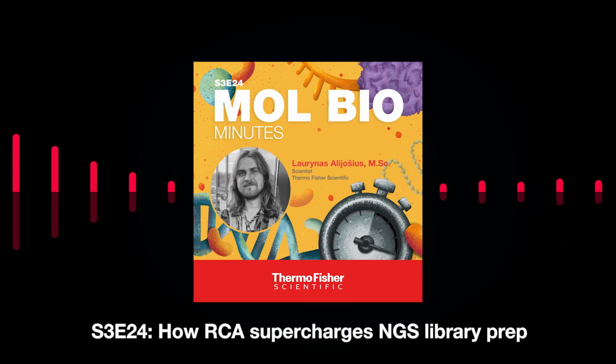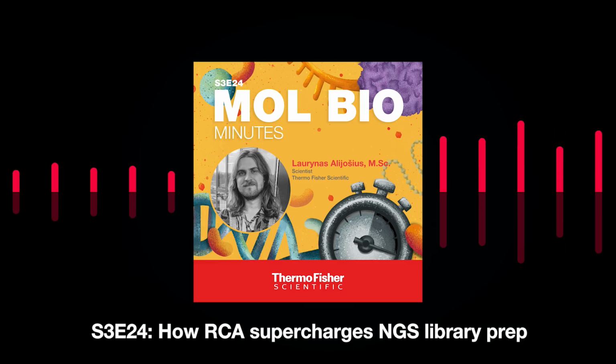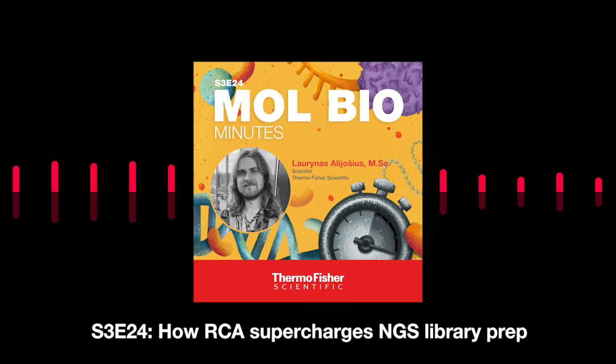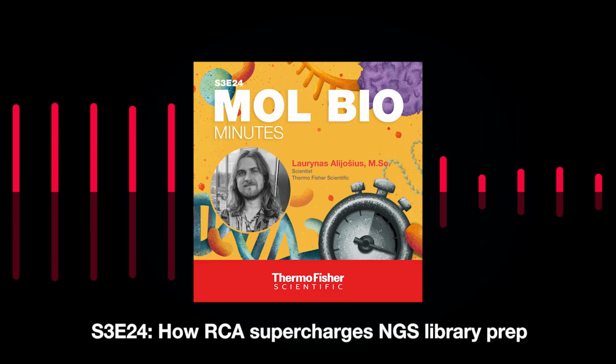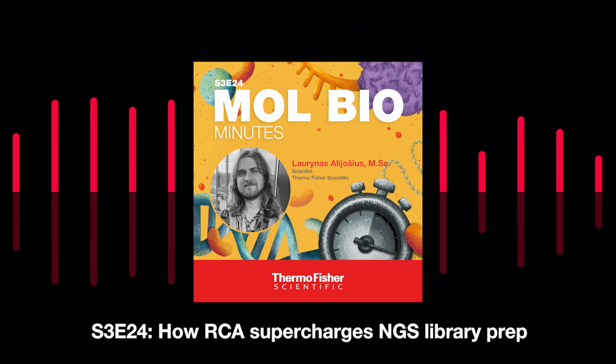So now that we have familiarized ourselves with some terms, let's dig deeper and uncover the magic of the RCA method. So, what makes RCA so special compared to PCR? Well, first off, RCA uses a constant amplification temperature, so there's no need to program multiple cycles with different temperatures and step durations. Plus, it operates at a much lower temperature than PCR, so it makes it super easy to perform amplification with a simple thermocycler or just a thermal block.